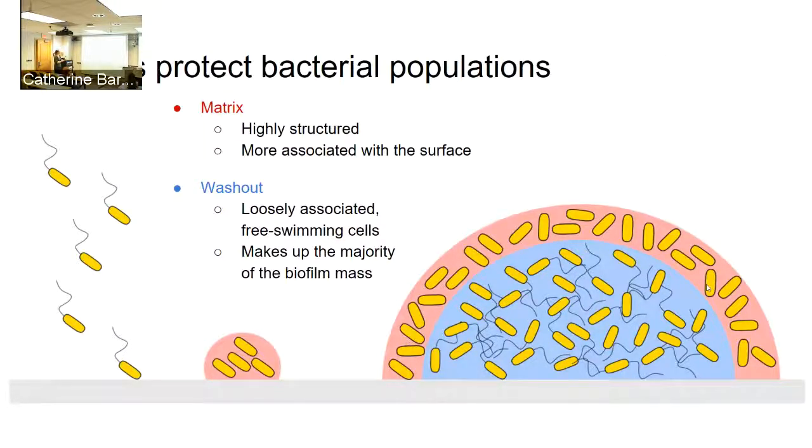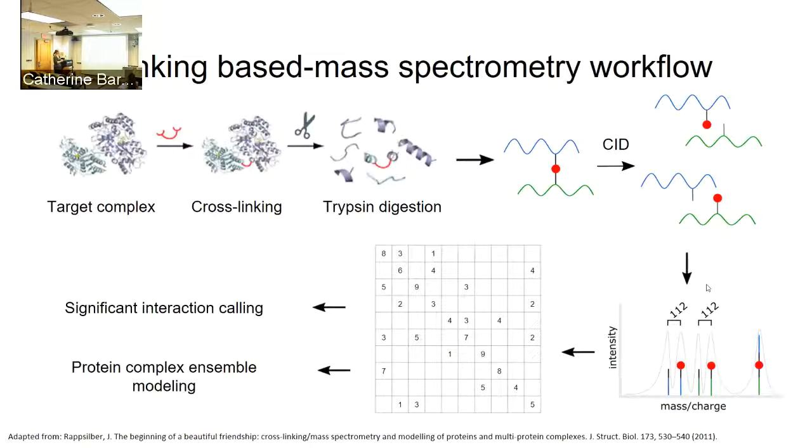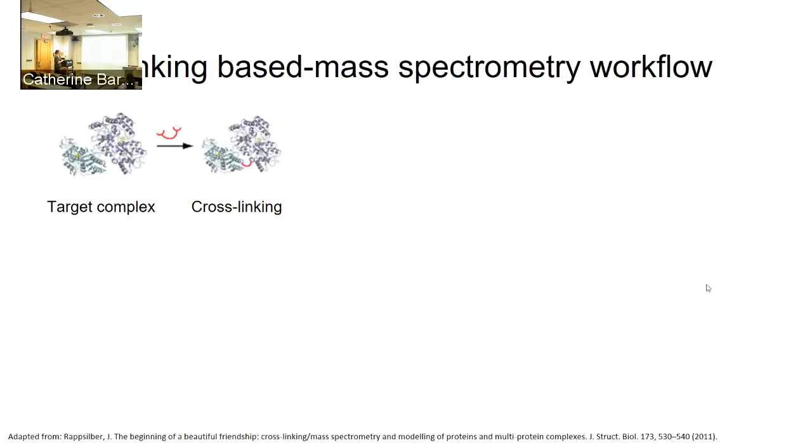Okay. So my goal for the rest of this talk is to just walk through our overall workflow for this technique, which will involve both the experimental side and the computational side. For starters, we have our UTI-89 cells that are growing on a plate. And if this is our crosslinker, it's called DC4, and I'll brag on its wonderful properties a little bit later in the presentation.